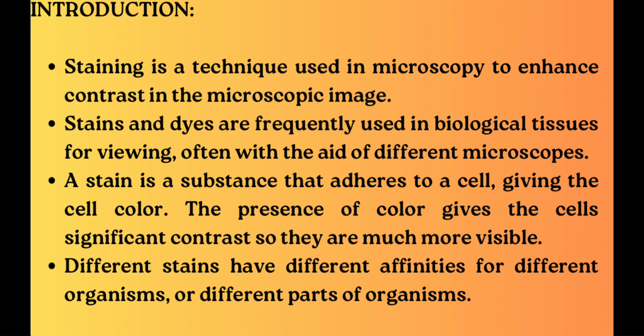In this video, we will be discussing gram staining. So before we look into the topic, we need to understand staining. Staining is a technique used in microscopy to enhance contrast in the microscopic image. Stains and dyes are frequently used in biological tissues for viewing, often with the aid of different microscopes.